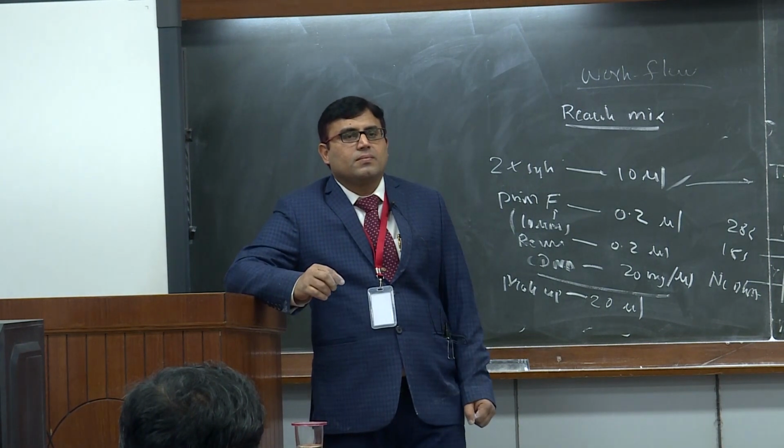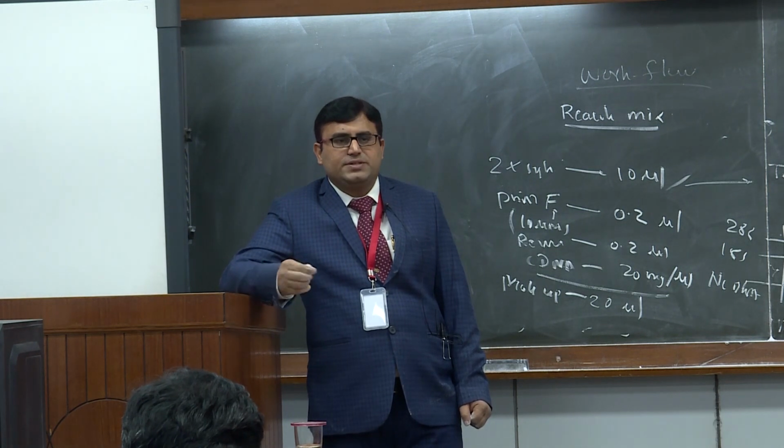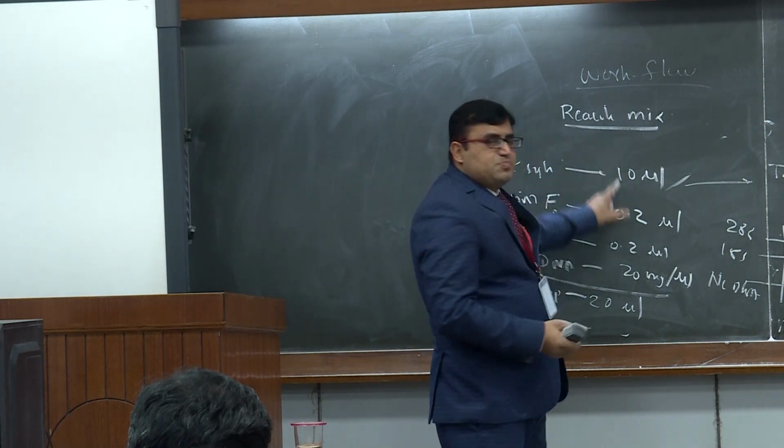Making up with what, sir? Water. Make up the volume with double distilled water or nuclease-free water, right? So this is per reaction.